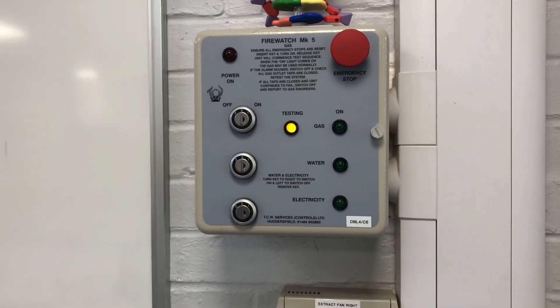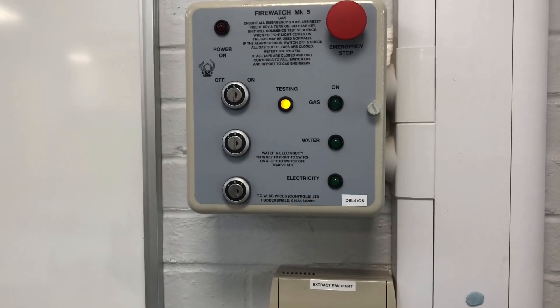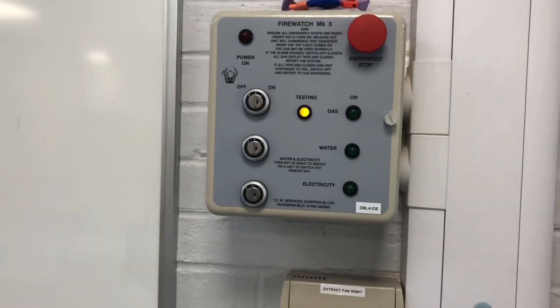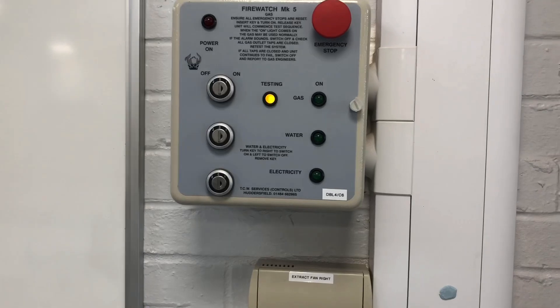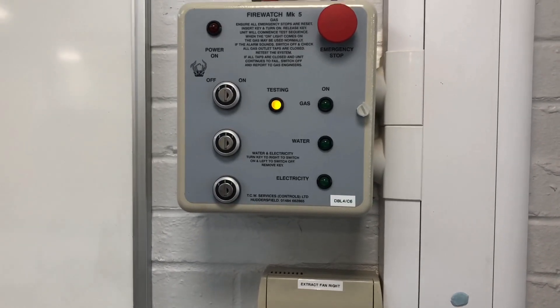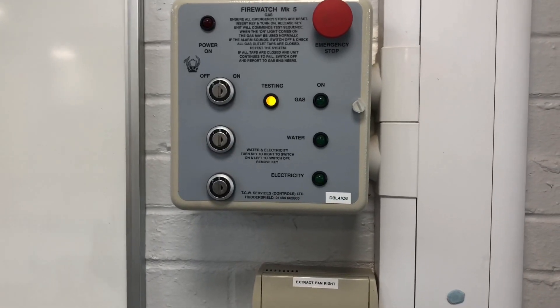It also checks if there are any gas taps that have been left on. If there are, it will alarm and we won't be able to have the gas come through — we'll have to reset with the emergency stop, or I can put the key in again, check all of the taps, and then we can try again.